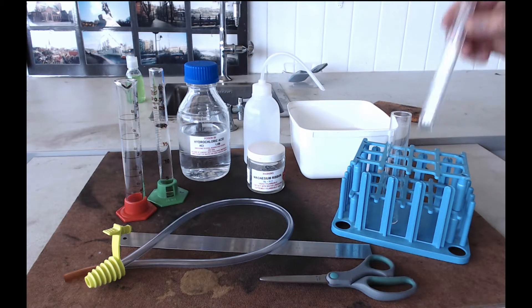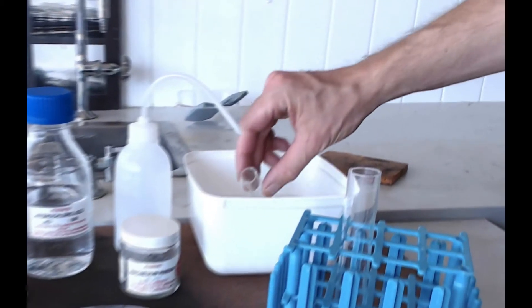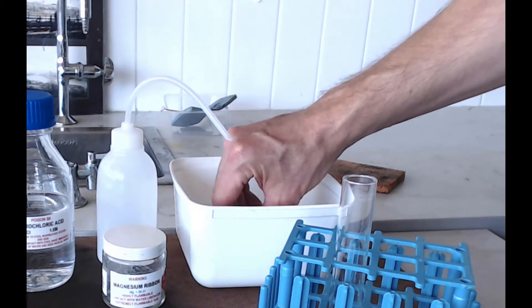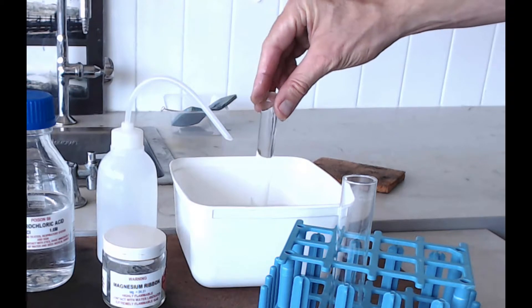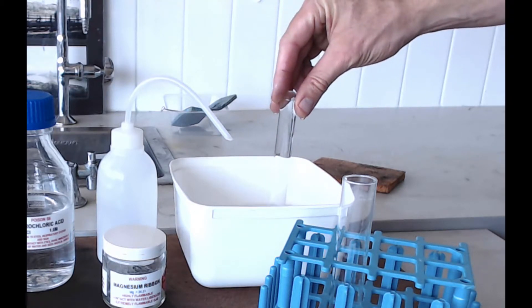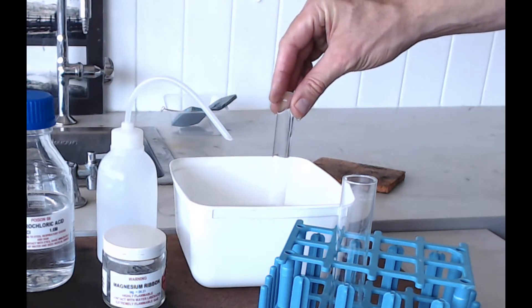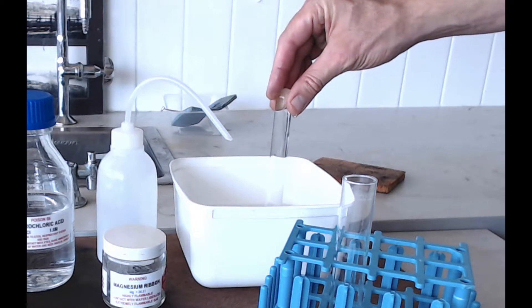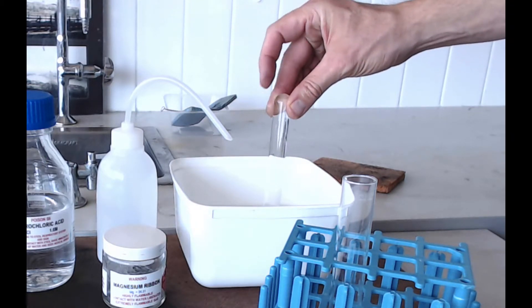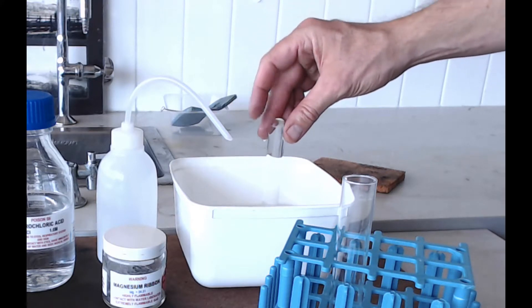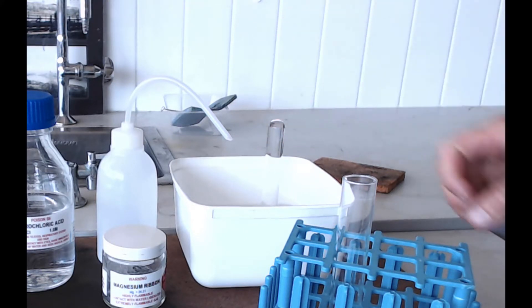Now being ready means that you've got a small test tube that is full of water from this trough, and it's standing upside down in there. So your trough does not need to be full of water, but it needs to be deep enough that you can get your delivery tube under this tube, so that the gas can collect inside it. You can stand it there if you want while you're getting other things ready.